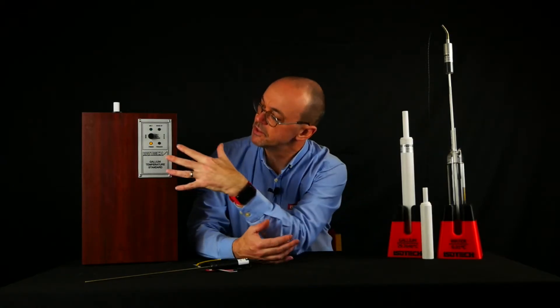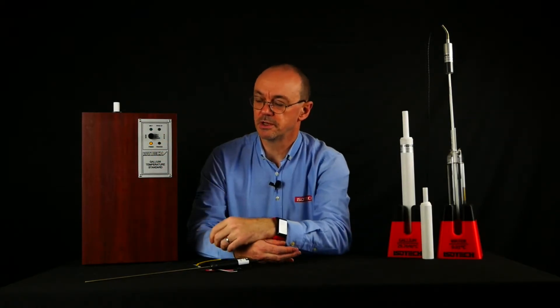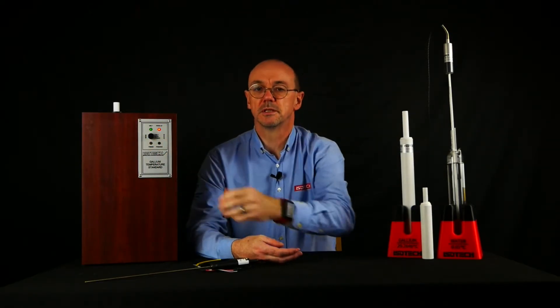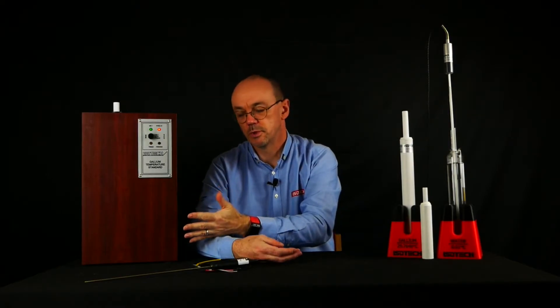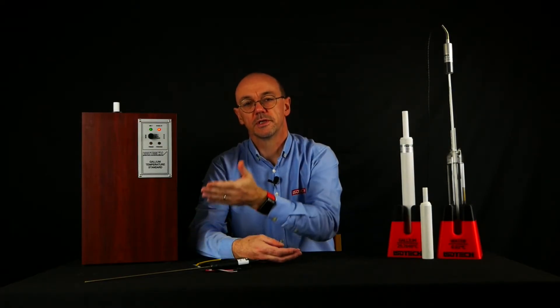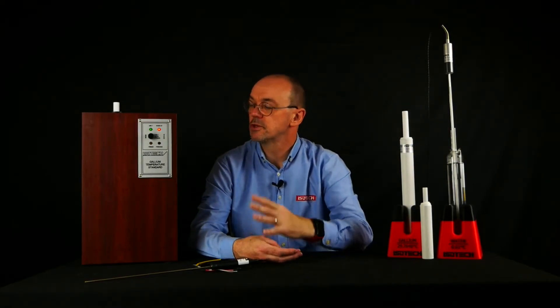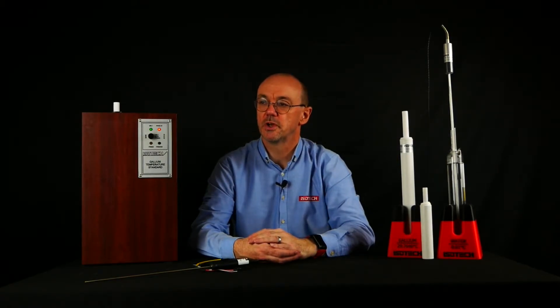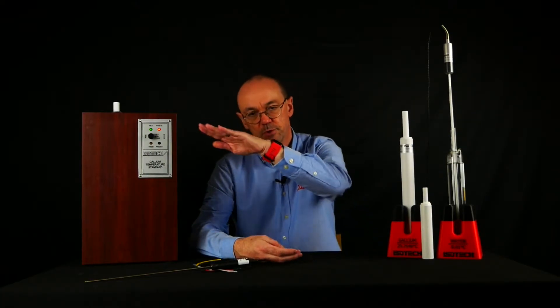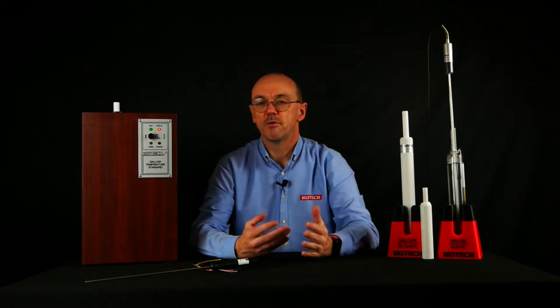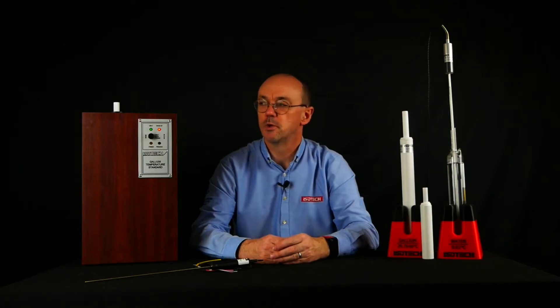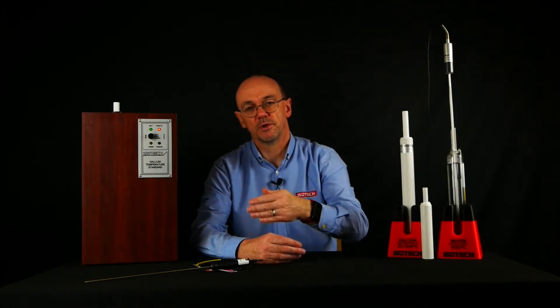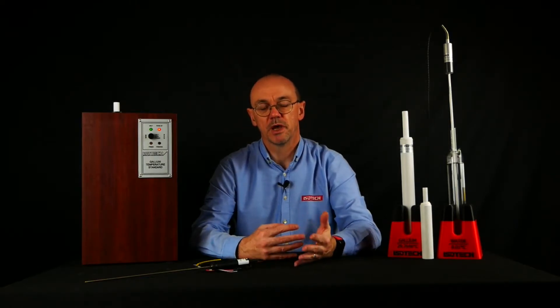At the moment the metal is solid. To use it, I simply change the control from freeze to melt, and the apparatus will heat up to a certain temperature to start to make the metal melt, to change to a liquid from a solid. As that starts to happen, temperature is automatically lowered. We'll have a period, maybe 12 to 14 hours, where the gallium inside the cell is going through the phase transition and we have the reference point.